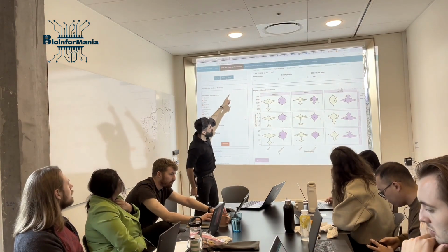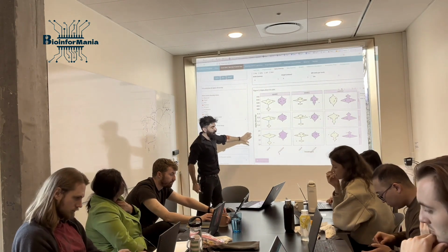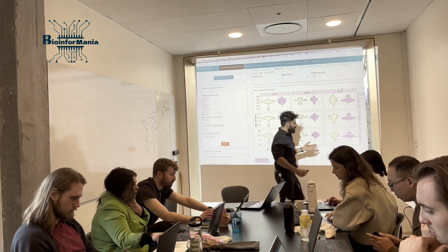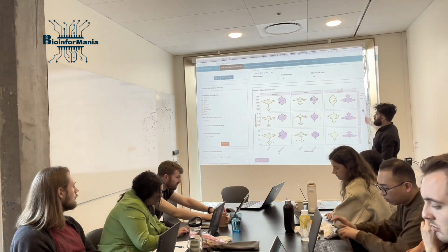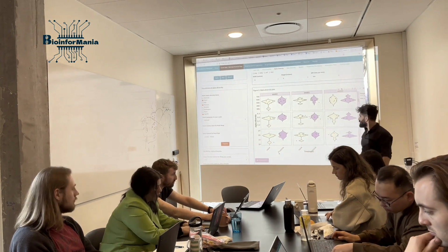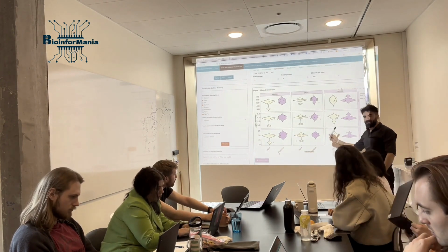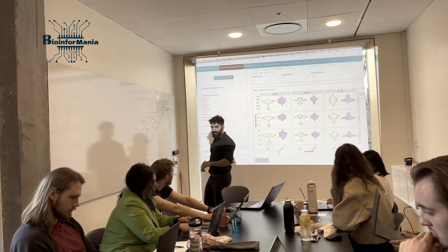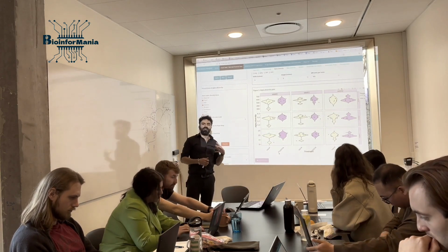What we have here on the rows, it's a multifaceted grid, so you have information about your alpha diversity, information about week, and information about treatment. Isn't it cool? This is almost like visualizing a matrix model.